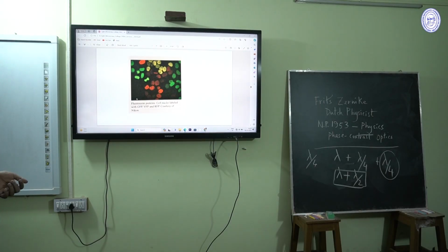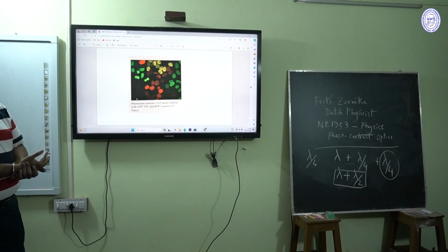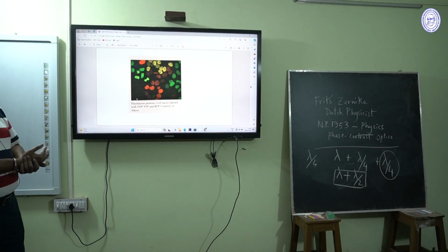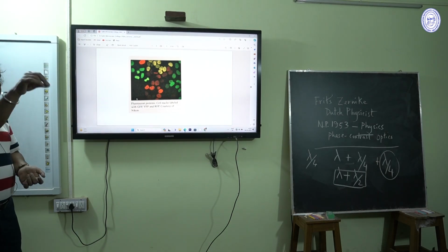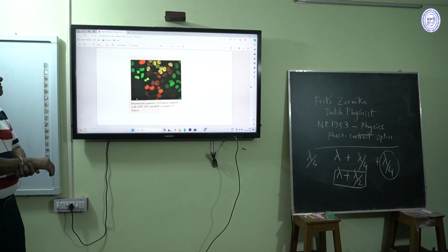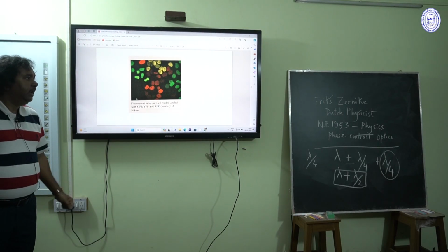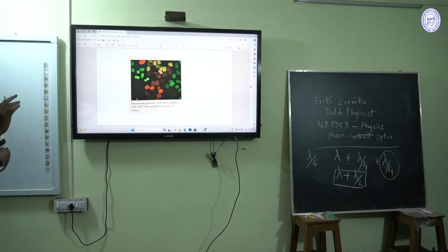The drawback of fluorescent microscopy is that it is costlier, and so many molecules are not autofluorescent. You have to stain with fluorescent dyes, particular dyes. The image is 2D, and the image quality is not superb in comparison to its advanced version, that is the confocal microscope.